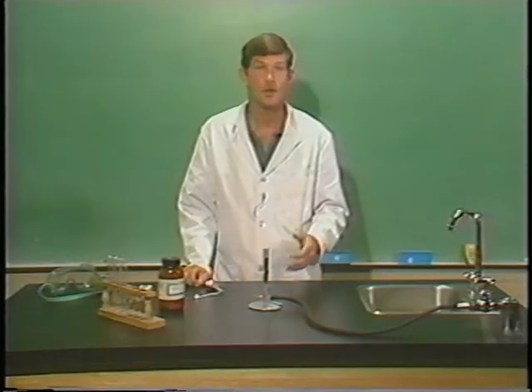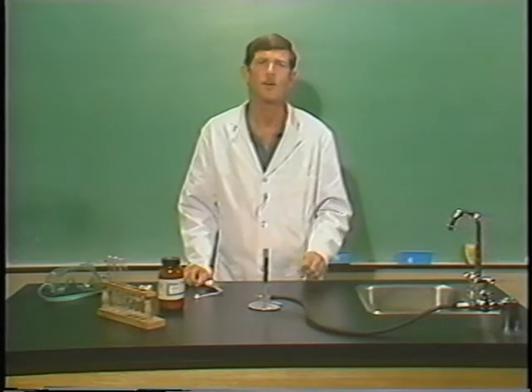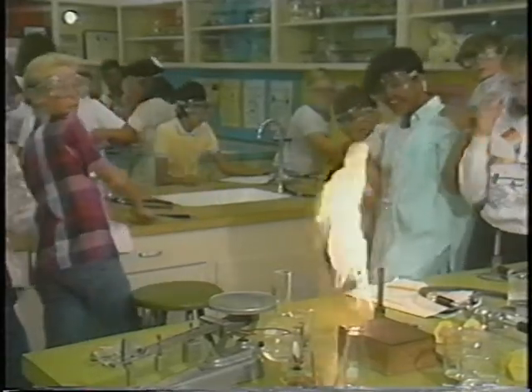Whether you're working with science at home or in the classroom, two of the most dangerous experiments are those concerning fire and chemicals. And sometimes in science, the unexpected happens and you should be prepared. Ask yourself some simple questions. What would you do if? Let's take this Bunsen burner for example. What would you do if flames started shooting out where the barrel connects to the base?